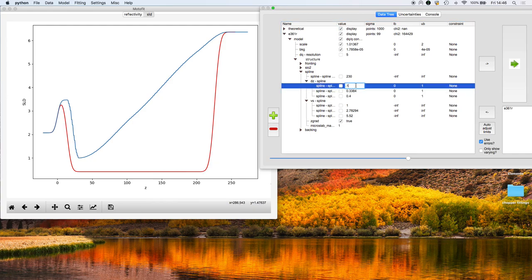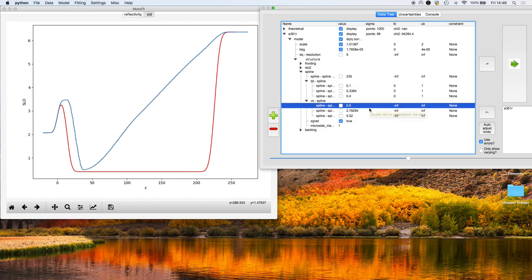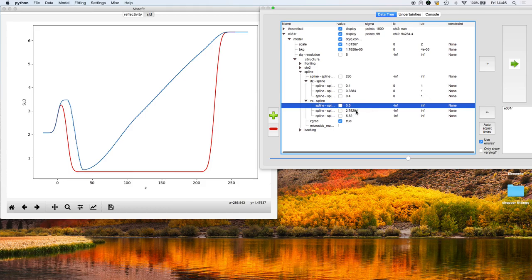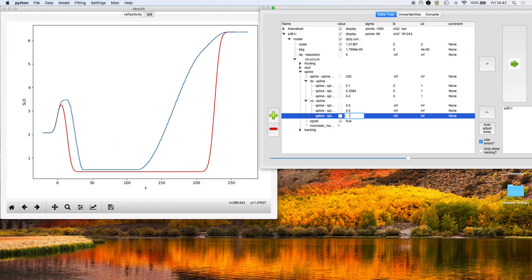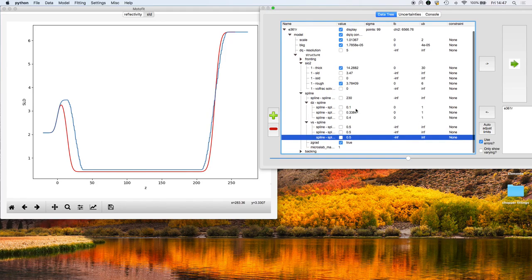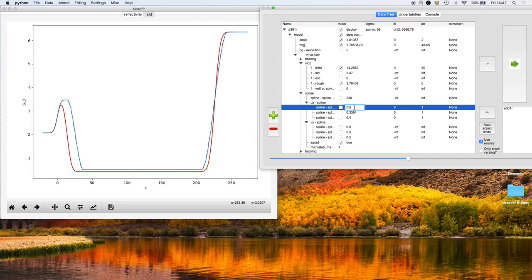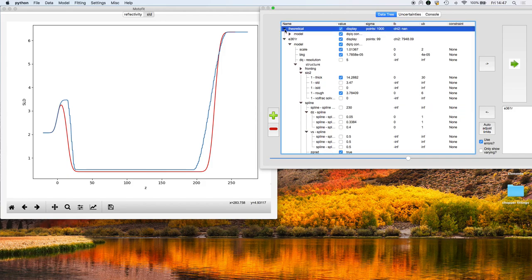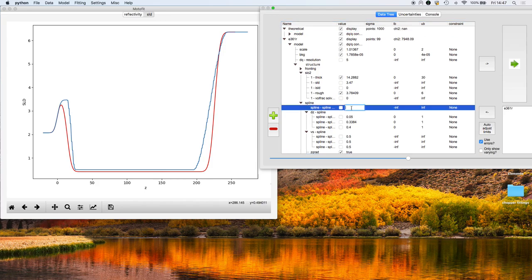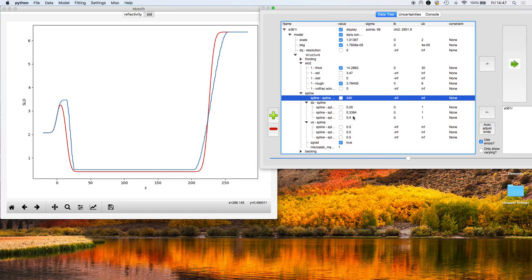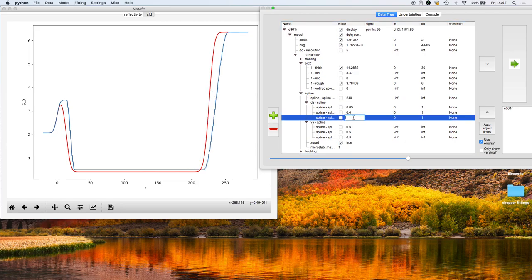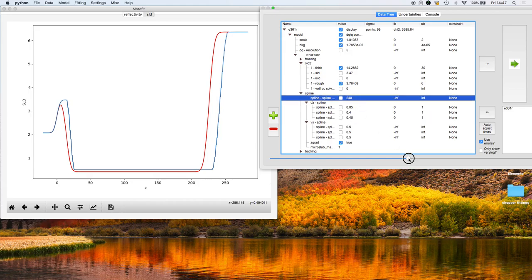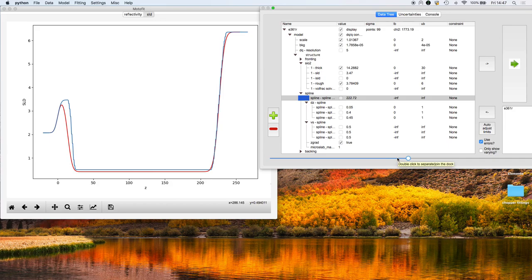We're going to use a spline now to fit this data set and see if our layer really is uniform or whether it'd be better described by this free-form model. I'm going to start off by approximating the model that I've already created with the uniform density. We're not too far off the original model that we had with our single slab describing this polymer layer.